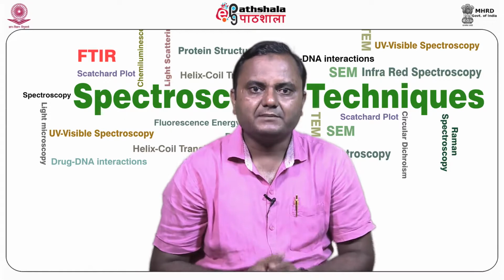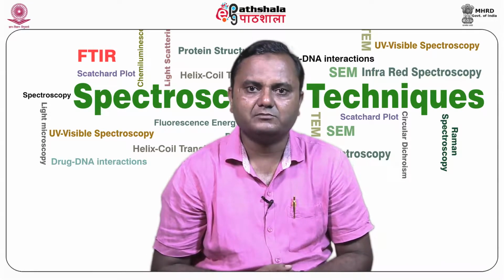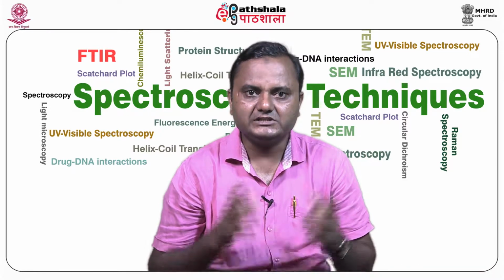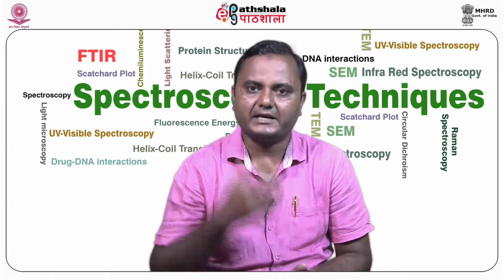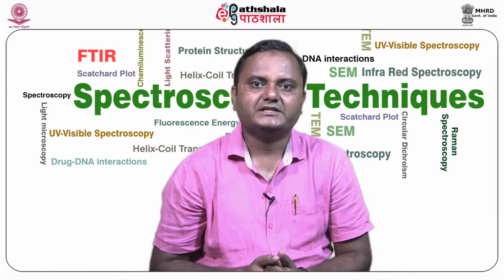The instrument must be calibrated before use. Calibration can be performed using a molecular weight standard or a scattering standard. Each standard has advantages and disadvantages that are described in the calibration section later. Now, we will discuss each type of detector in detail.